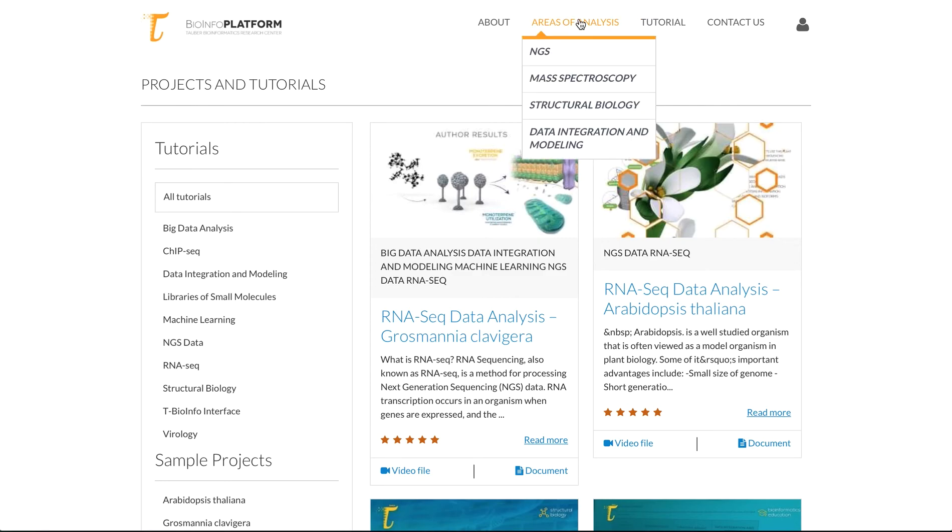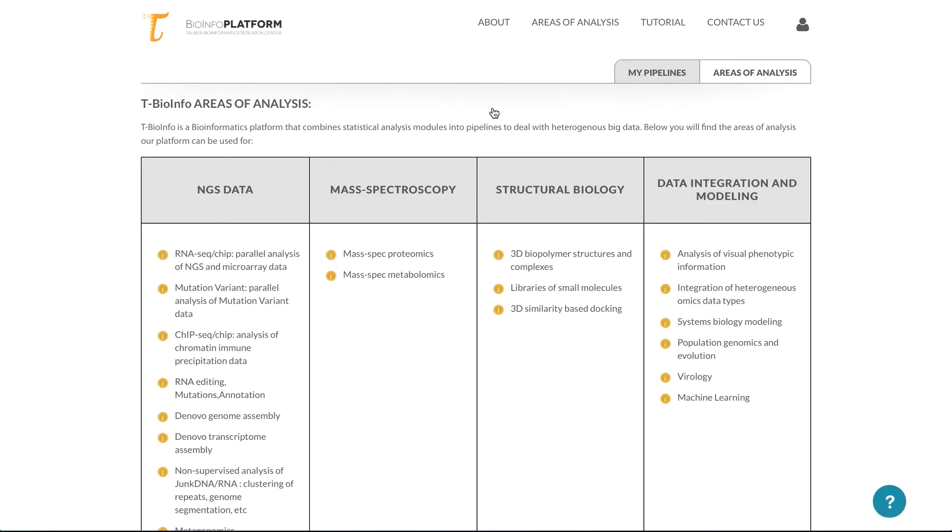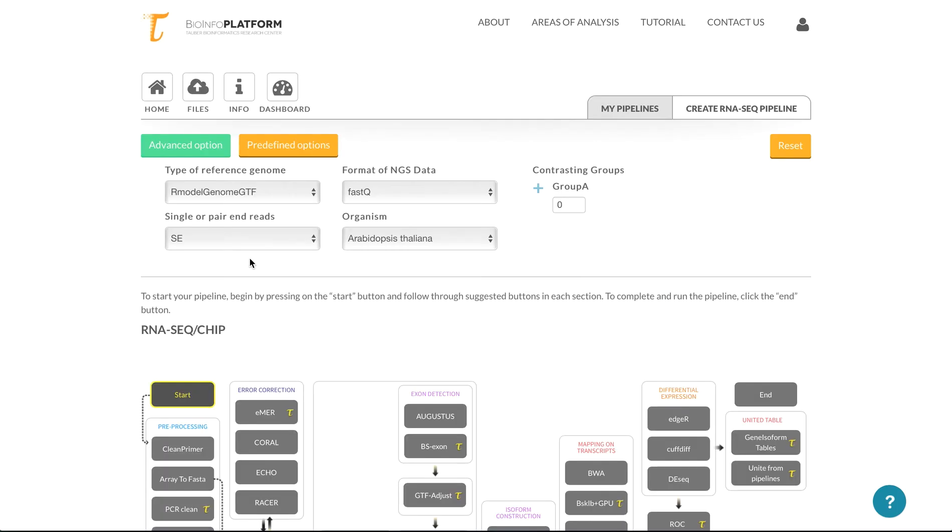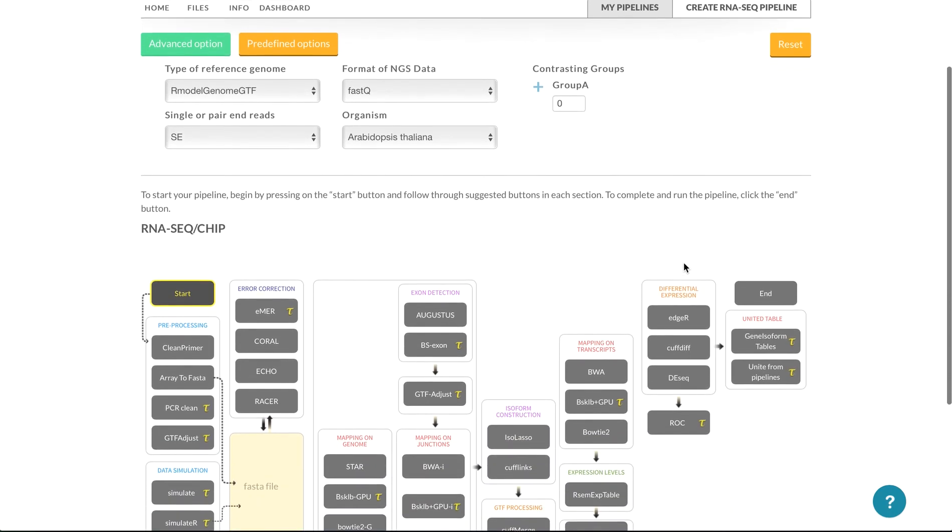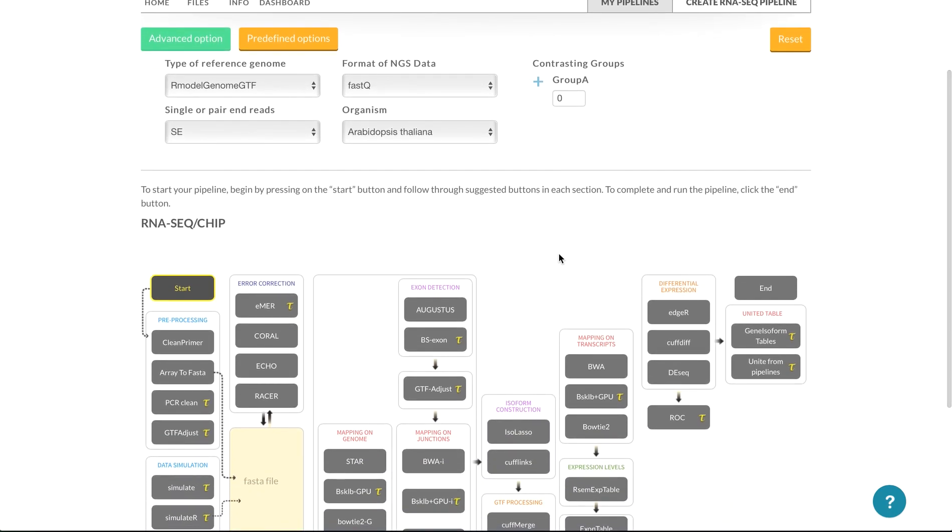And also, if we go back to the areas of analysis, and for example, RNA-Seq, we have this guided tour button over here. If you get stuck anywhere, it will help you keep on going and see what's happening. Yeah, that's pretty much it. For a demo account, you can contact us at info at pinebiotech.com.